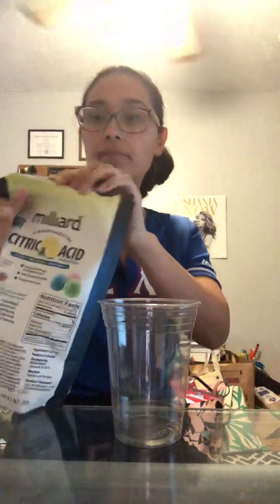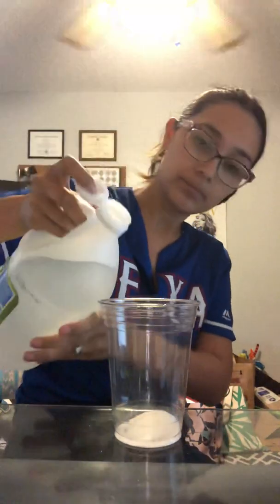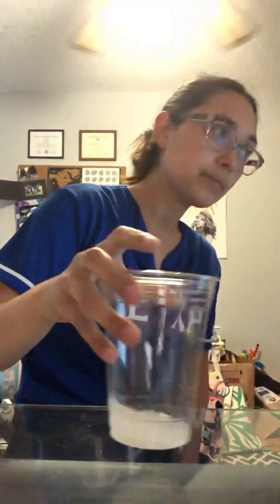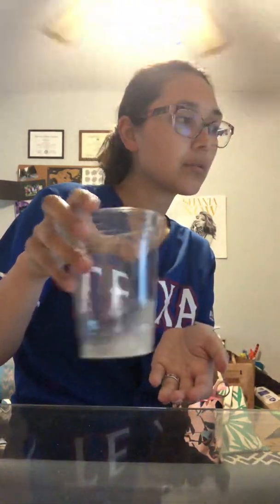Okay, let's do vinegar. Let's mix this with vinegar and see what happens. Okay, let's mix. Nothing going on yet, just mixing. They are dissolving just like the rest of them. It's a slight temperature decrease.